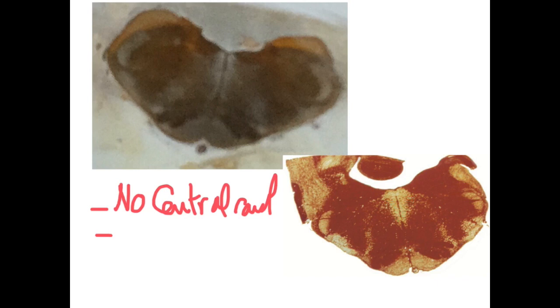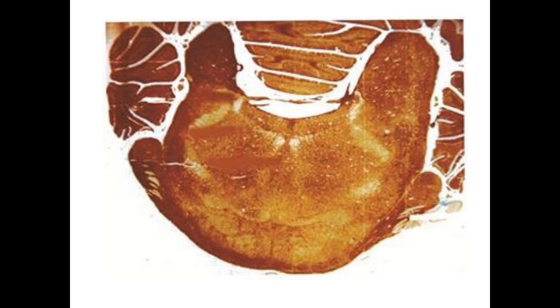Sometimes you will notice the presence of accompanying parts of the cerebellum and sometimes not. So it is not a permanent character. So the open medulla is characterized by absence of the central canal, but the pyramids are present in the same appearance like that of the closed medulla sensory decussation with the mustache formed by the medial accessory olivary nuclei. So we have here the pyramids completely present with the surrounding medial accessory olivary nuclei.